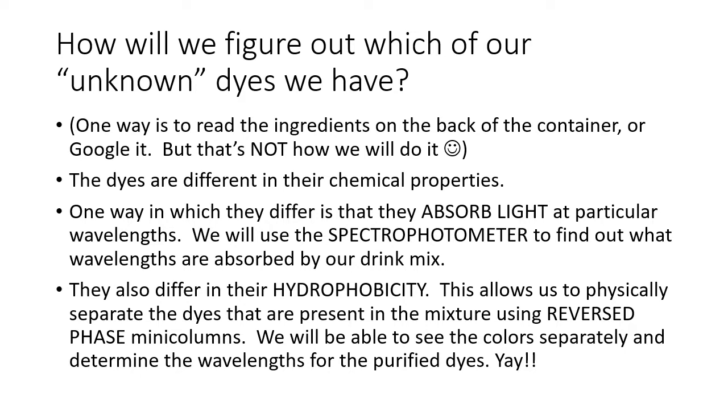We're also going to exploit the hydrophobicity differences among these, which is going to allow us to physically separate the dyes from each other by reversed phase mini columns. So we'll be able to see the purified dyes separately and then determine the wavelengths for the purified dyes.